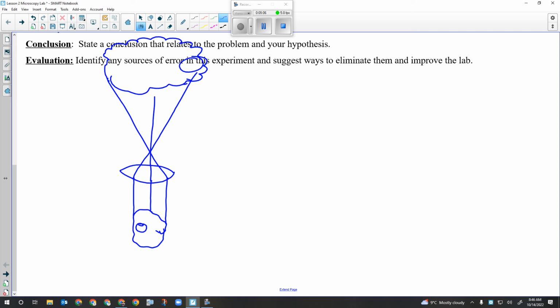Okay, so that's in general, very basically, how a microscope works. Okay, lenses bend light, and that results in its magnification. Right. You can also have lenses that converge light. Okay, like at this point right here. If you ever took a magnifying glass and caught the sun with it, you can get a spot that's really, really hot where all the rays converge. It's the same idea. That would be this point right here where all the rays are converging, and the light would be very intense there. Of course, you've never burned any ants or anything with the magnifying glass because nobody would be that mean. Okay, so everyone all right with that? How that works? Okay.